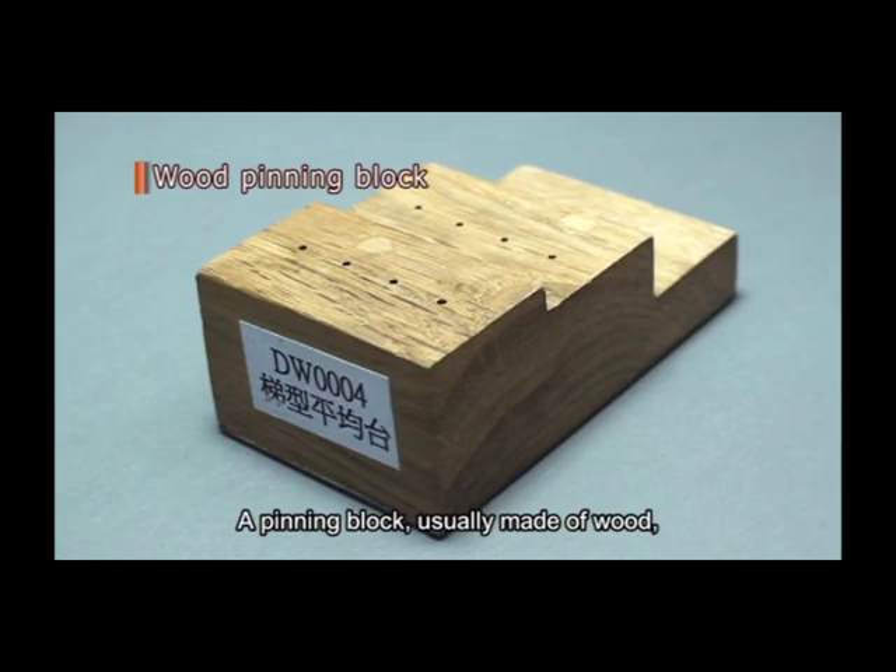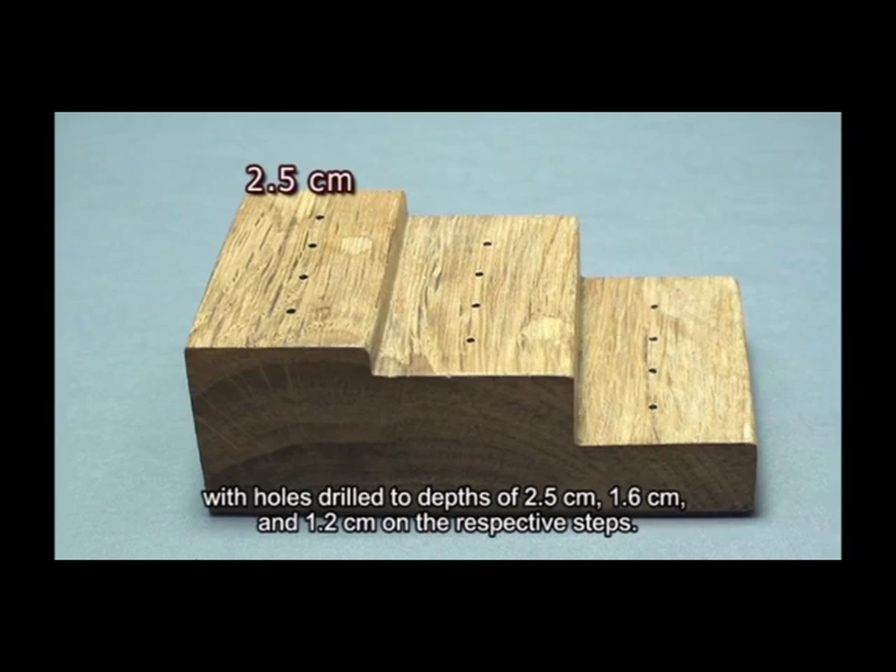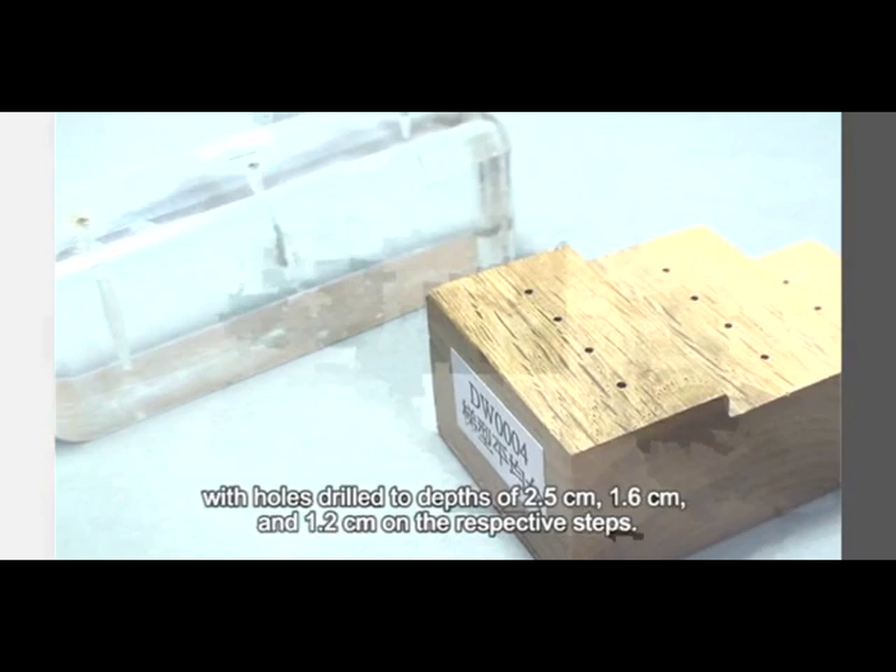A pinning block, usually made of wood, is shaped like a three-step stair with holes drilled to depths of 2.5 cm, 1.6 cm, and 1.2 cm on the respective steps.